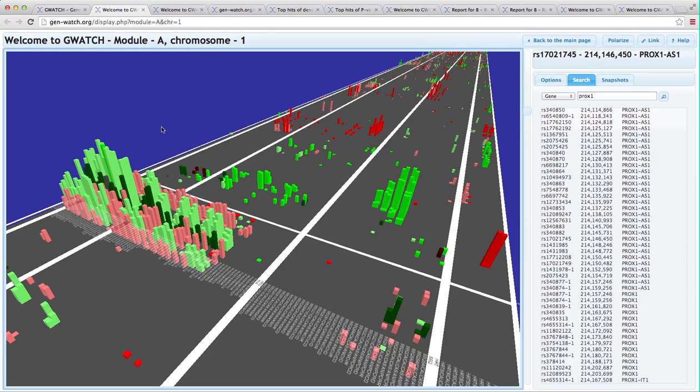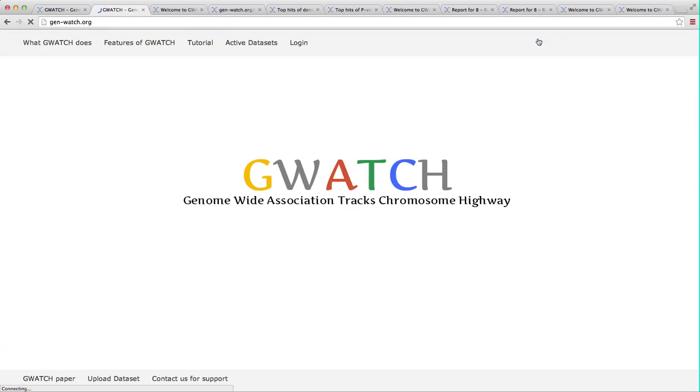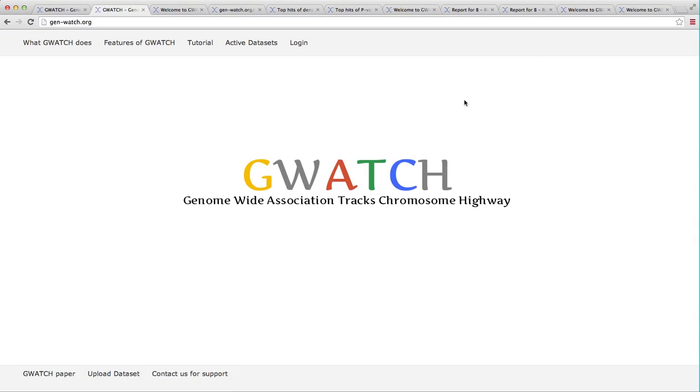This is GWATCH in a nutshell. As you can see, it has a number of features, and the best way to get familiar with them is just to go to GWATCH homepage and navigate the powers and potential of GWATCH. We are still in the beta testing phase of GWATCH, so we welcome your suggestions, bug detection, criticism, and impressions.